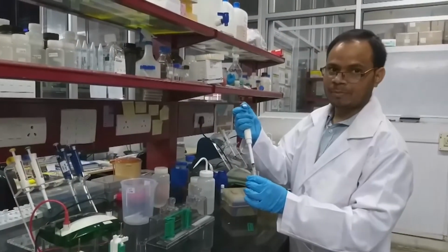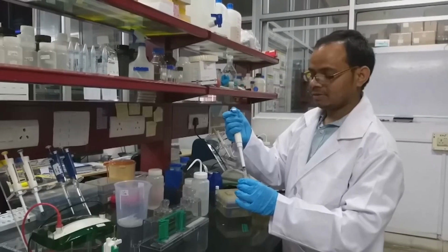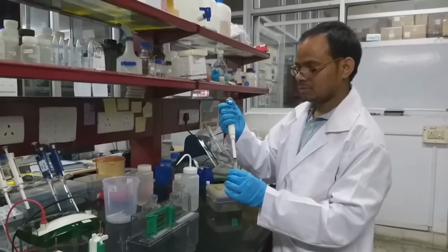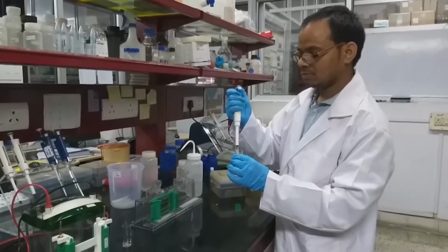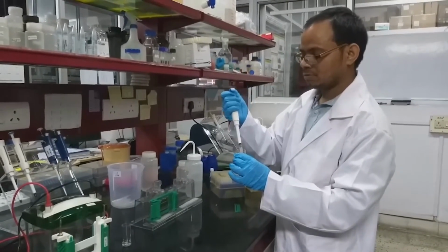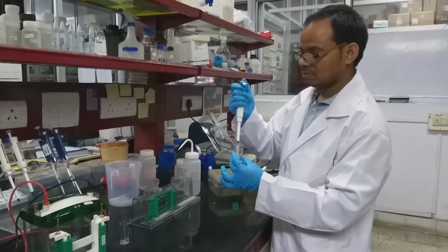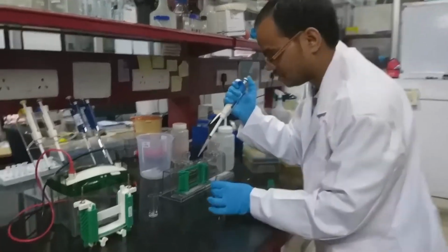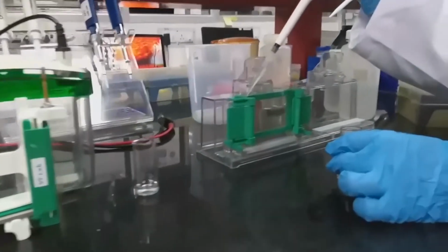We have to mix properly after adding the TEMED. And you just add at one corner.